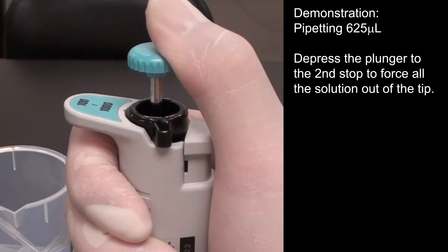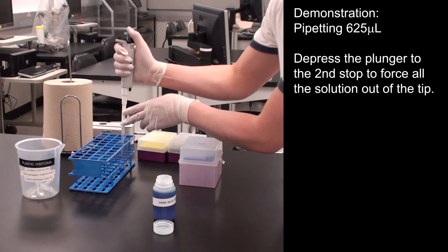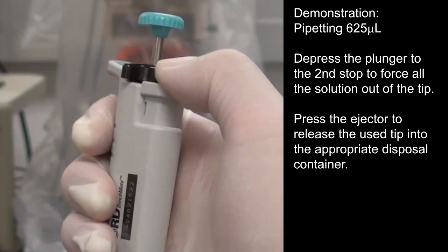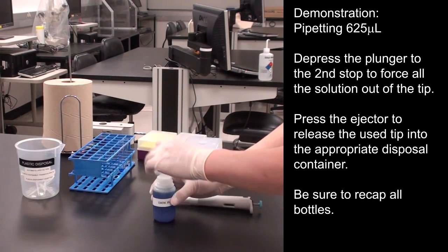Depress the plunger to the second stop to force all of the solution out of the tip. Press the ejector to release the used tip into the appropriate disposal container. Be sure to recap all bottles.